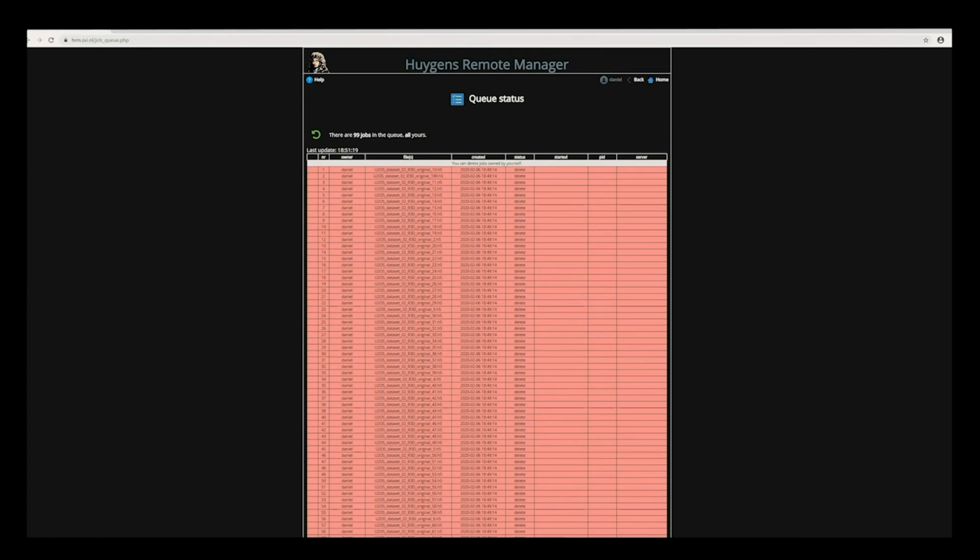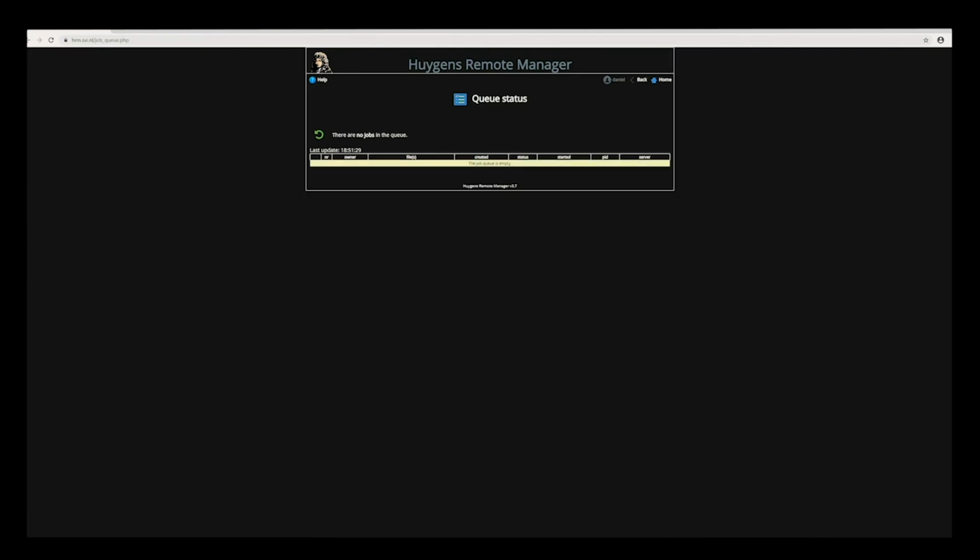in previous versions of HRM. It used to be a little bit unstable here. We've also worked hard to improve this part. You will see that HRM recovers now in a few seconds, and that it is again waiting and listening to process new jobs. So this has become a little more robust, and we are happy to ensure that the whole of it is working more robustly.